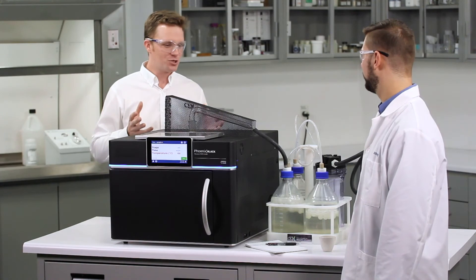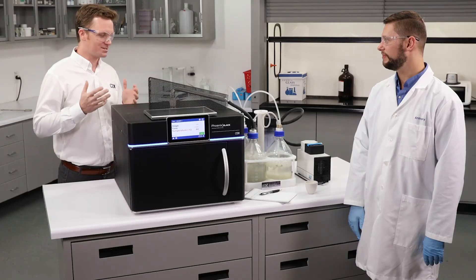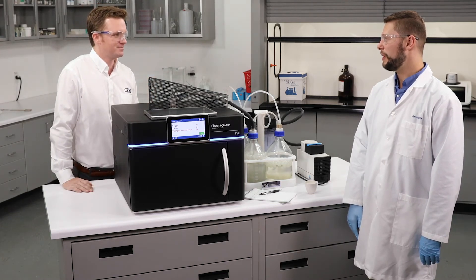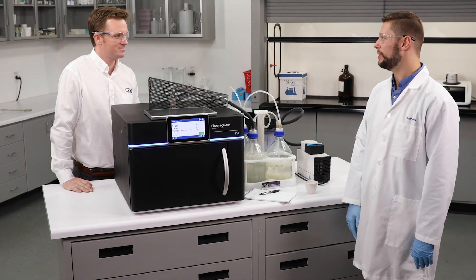What about the results — what kind of number did you get for your final ash? We were expecting 1.10% ash and we got 1.10% ash.